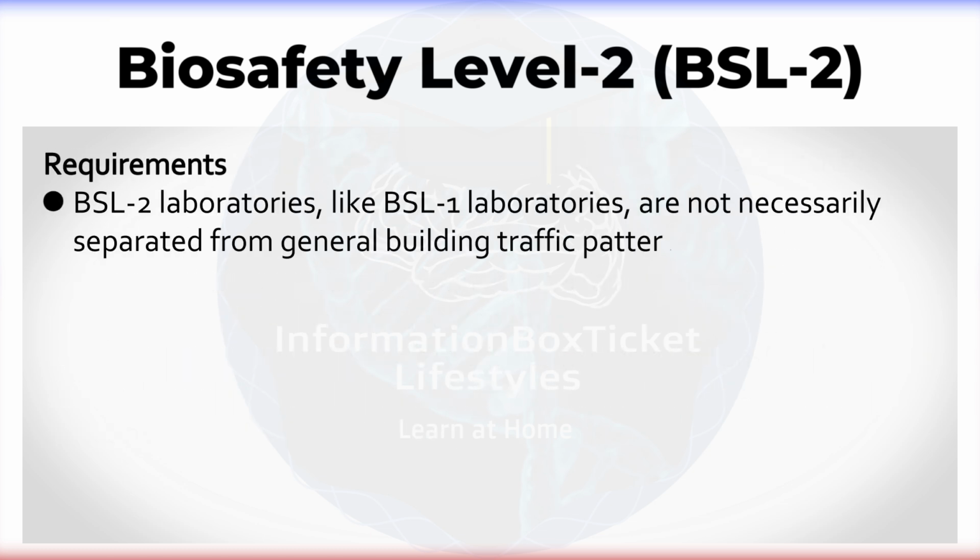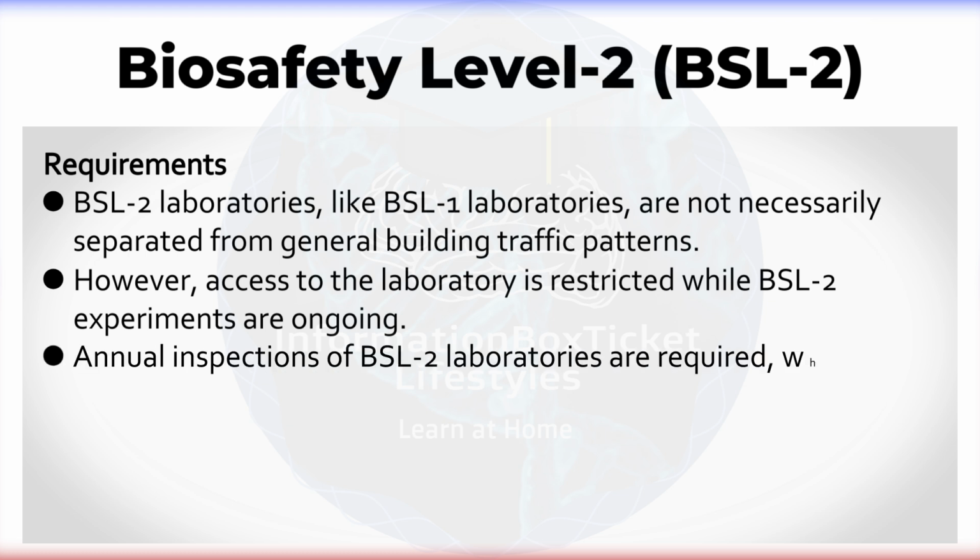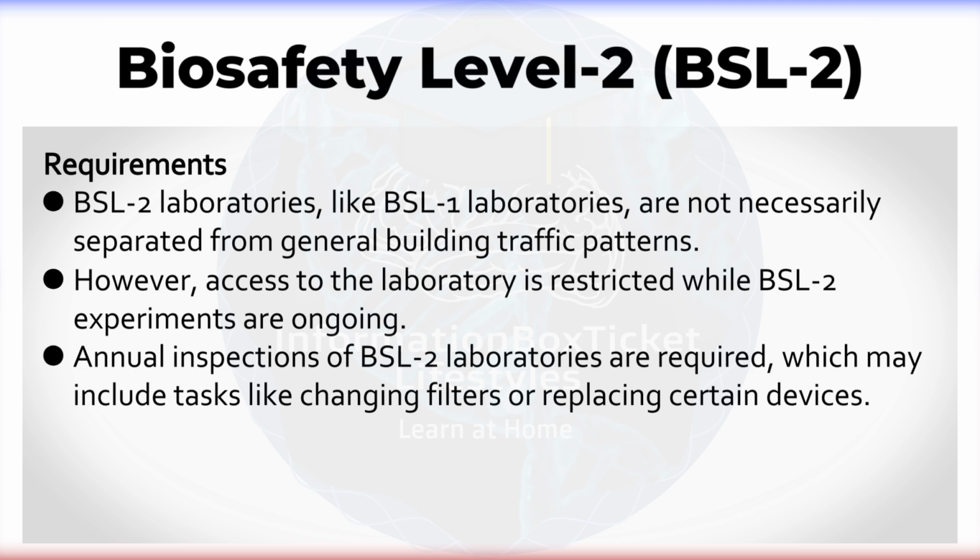Requirements. BSL-2 laboratories, like BSL-1 laboratories, are not necessarily separated from general building traffic patterns. However, access to the laboratory is restricted while BSL-2 experiments are ongoing. Annual inspections of BSL-2 laboratories are required, which may include tasks like changing filters or replacing certain devices.